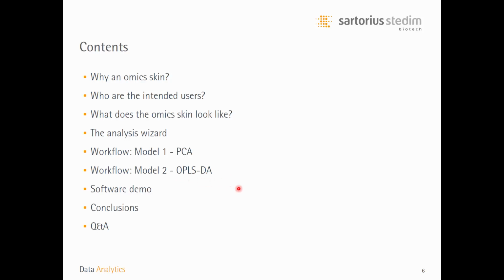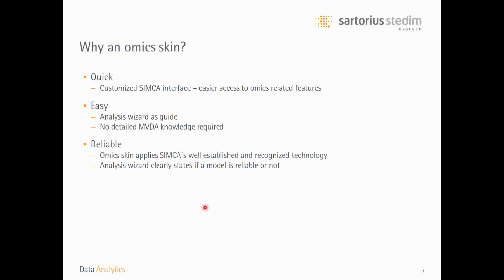We are going to demonstrate the analysis wizard in great detail throughout the software demo, but we will also demonstrate additional tools outside the analysis wizard that can also be easily accessed inside the Omics Skin. There will also be some conclusions and Q&A towards the end.